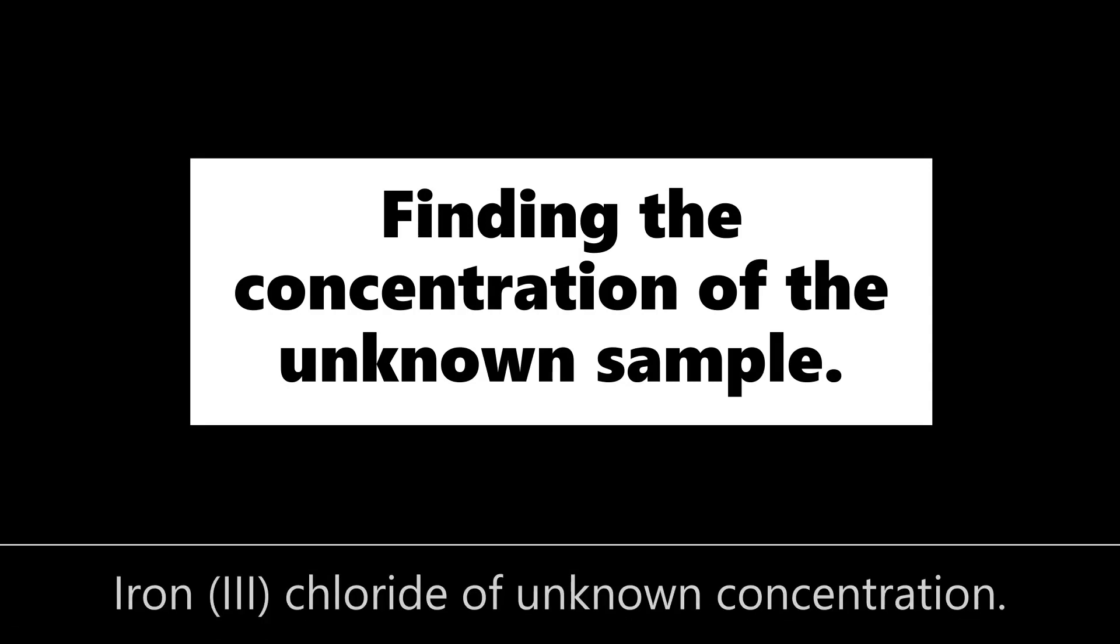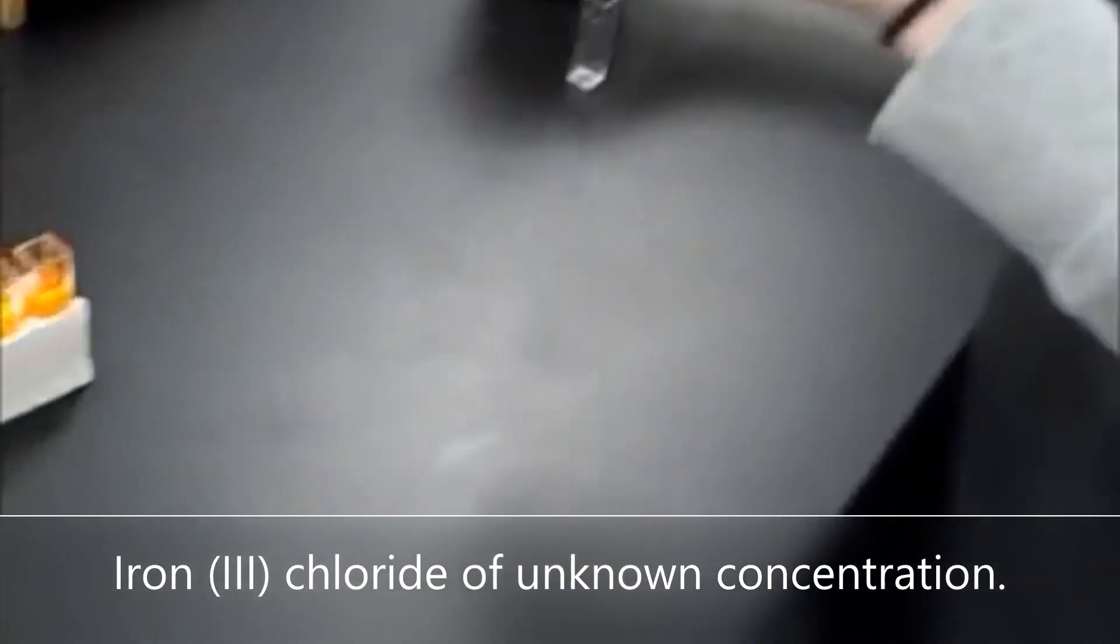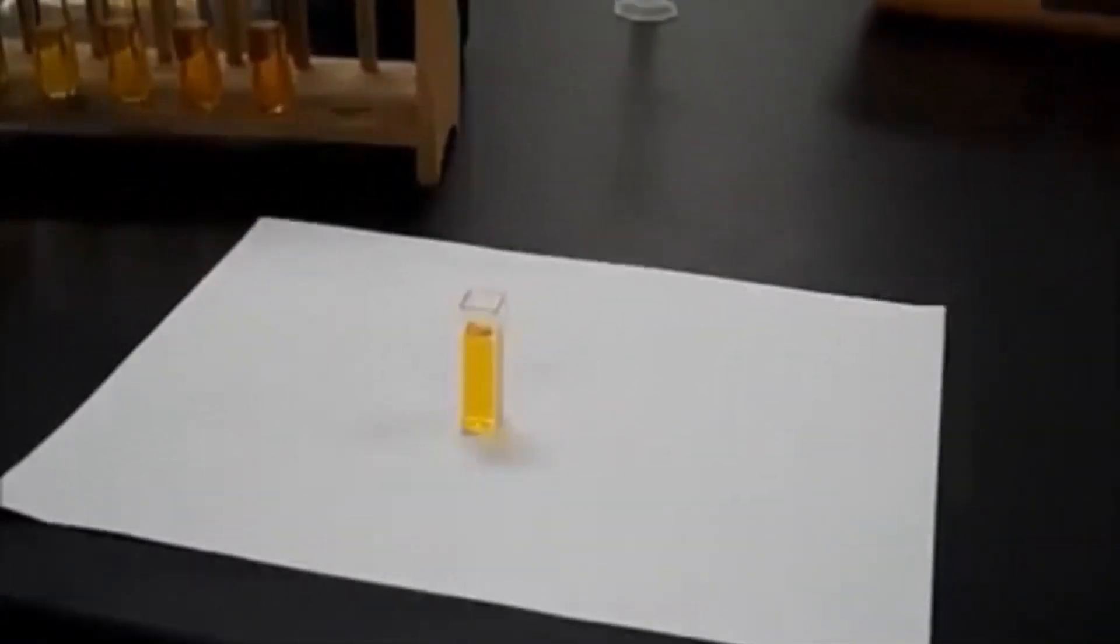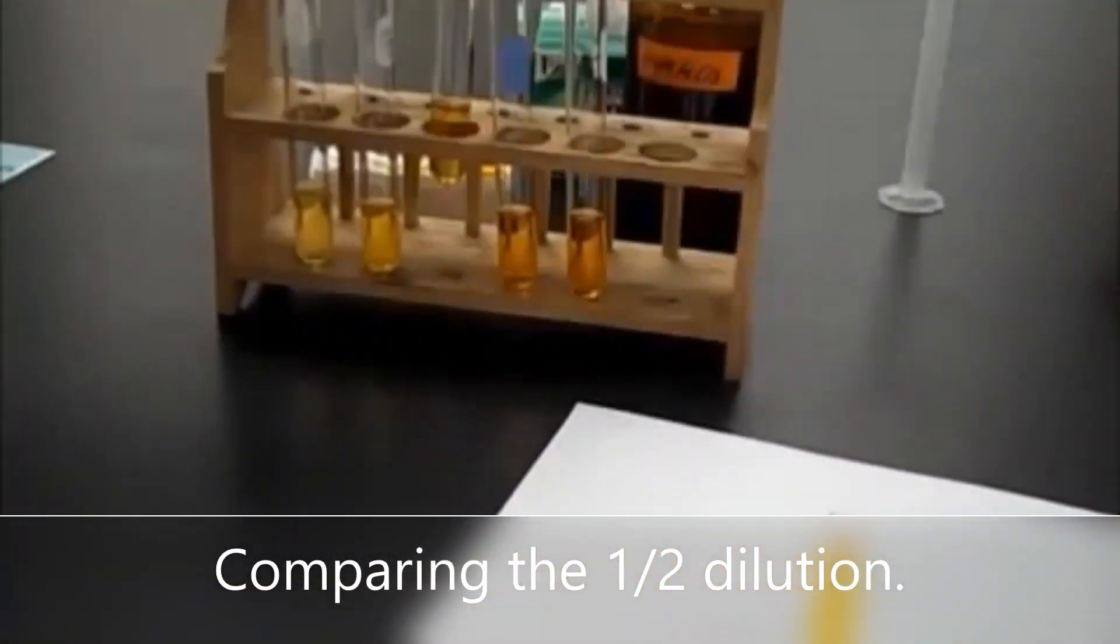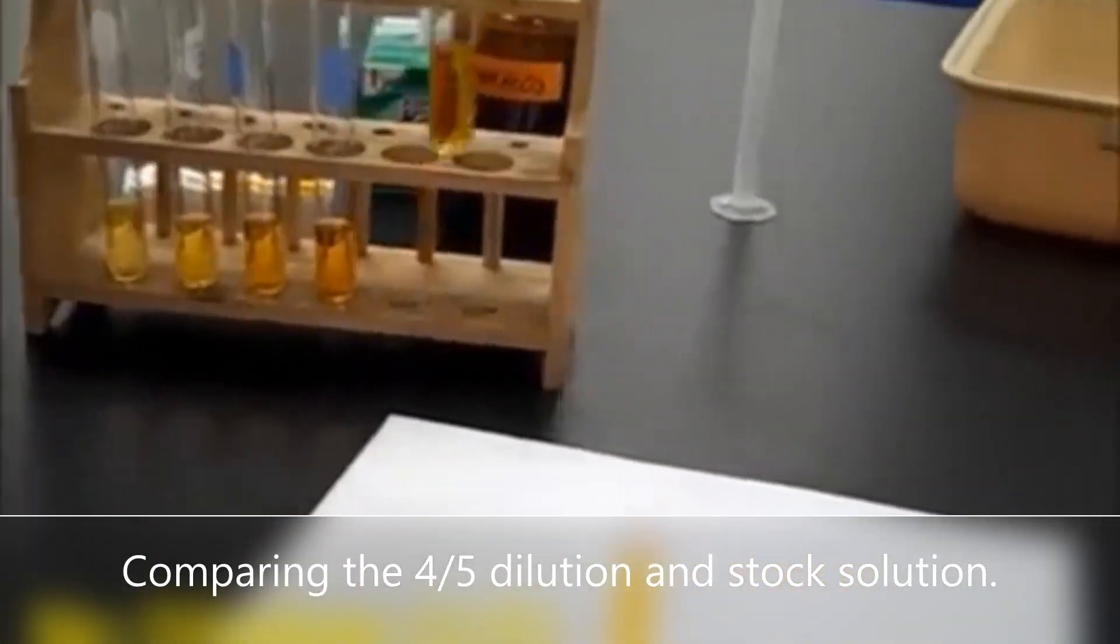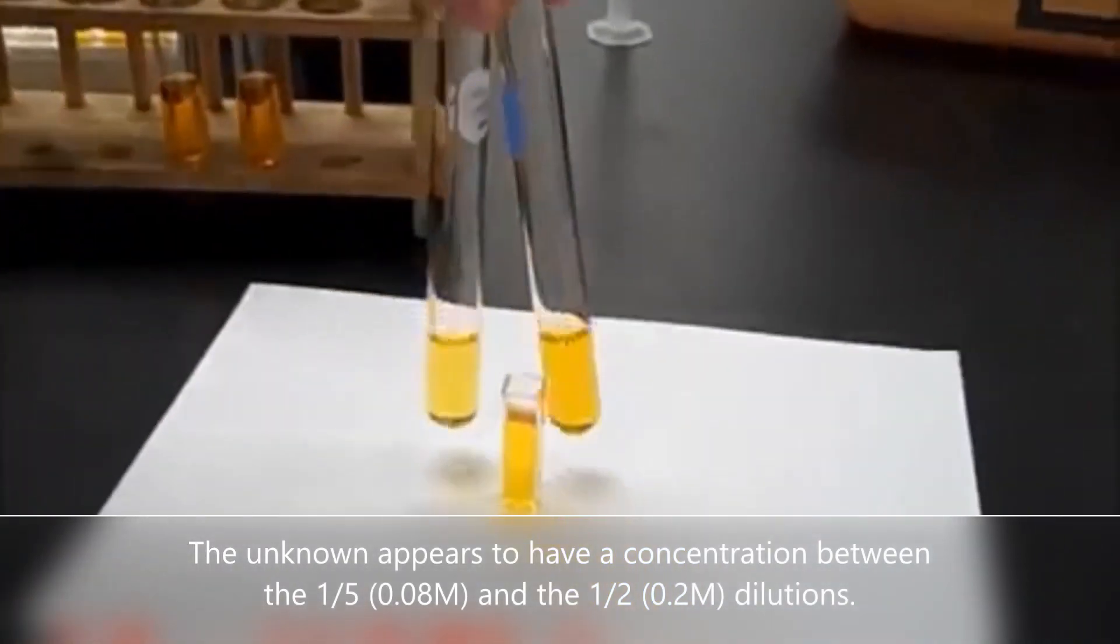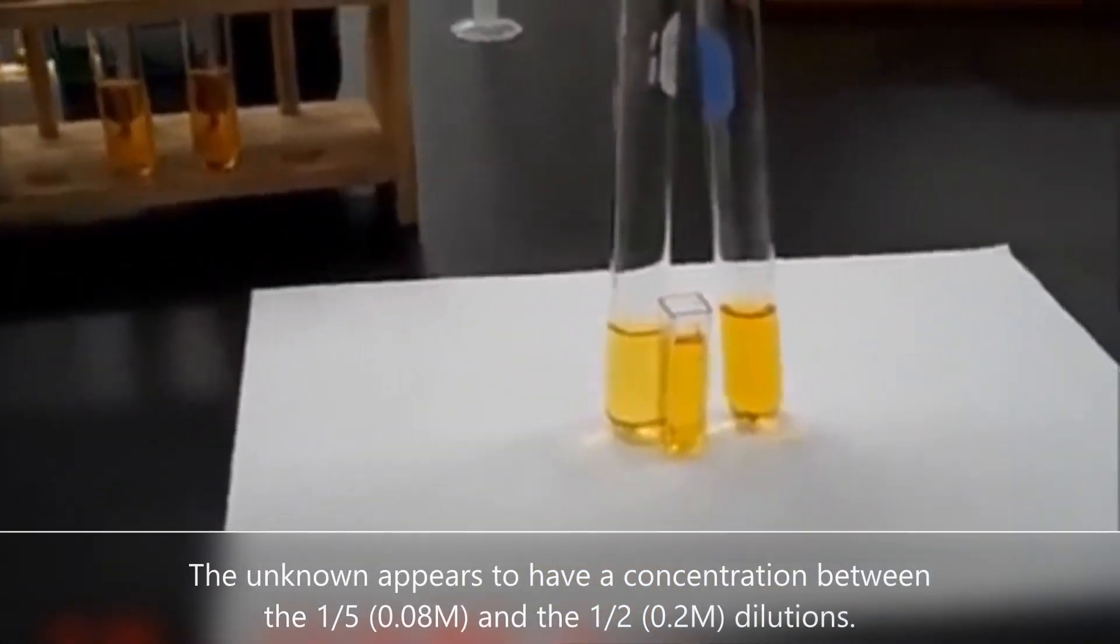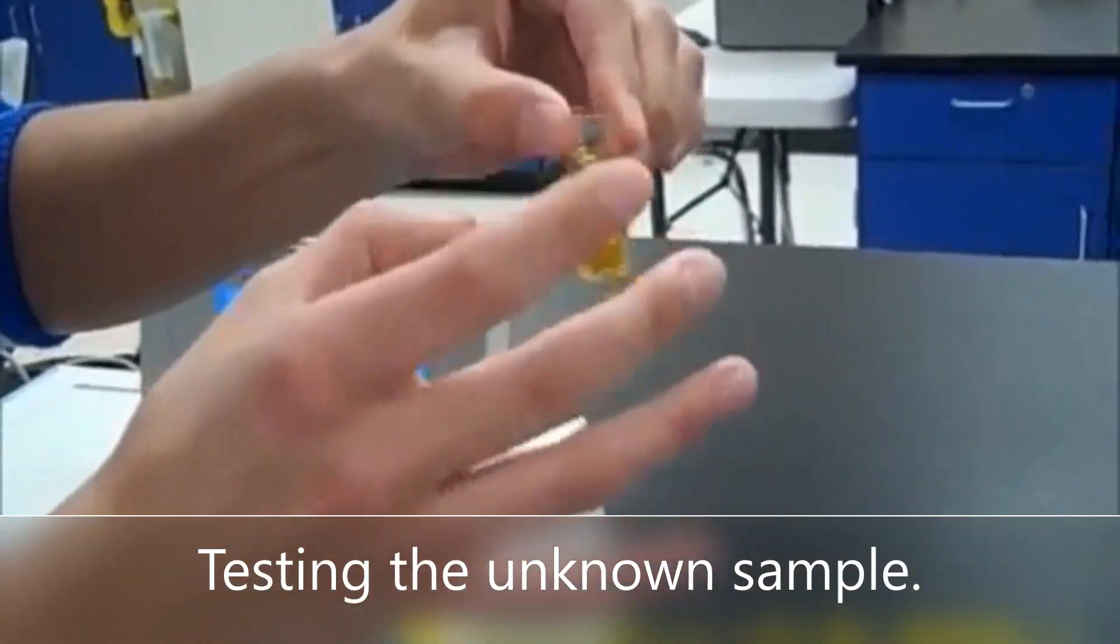Now we'll look at finding the concentration of the unknown sample. So the unknown sample of iron chloride we see here being compared to the different dilutions we created earlier. And as we do those comparisons we want to see which of the samples is the unknown solution most similar to. We see that it appears to have a concentration somewhere between the one-fifth and the one-half dilutions. This gives us a ballpark idea of the concentration for the unknown sample.